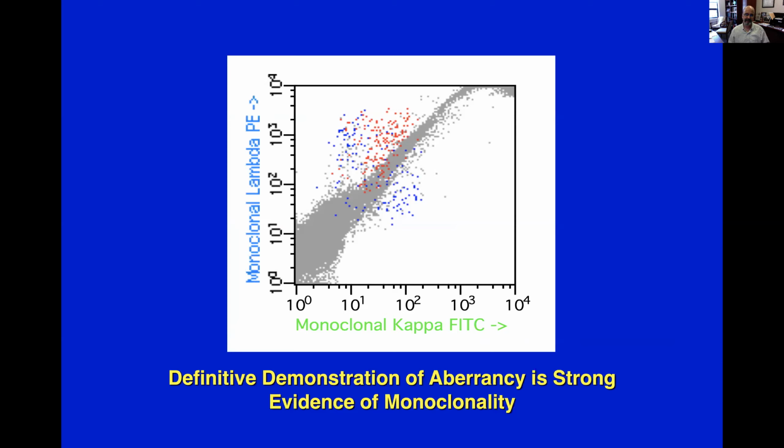So this type of honing in on populations and looking at clusters is what this analysis gives you the power to do. To me, again, to get on my soapbox, this is much more like a pathologist's approach to looking at flow data, similar to how when you're sitting at a microscope, you want to scan it at low power in the way you like. You want to determine where you want to go and look at high power. You want to determine what markers to get. And this is sort of that kind of approach where all data is available to you. Somebody else has not gated and taken pictures and sent them to you, and so on and so forth.